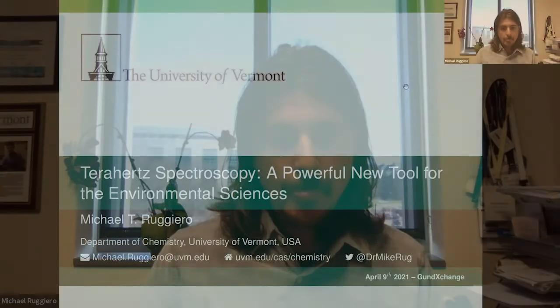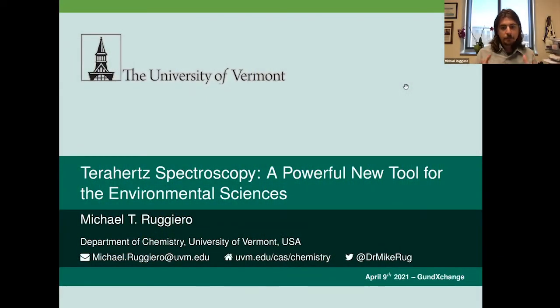But really, the thing I want to say up front is that, like Jenny mentioned, my research is really interdisciplinary. And so we have this tool, this terahertz spectroscopy tool, that we have in our lab, and it can be applied to many different areas. And we'll see this in the talk. And what I just want to keep in everyone's mind is that everything we do starts from just a creative imagination.